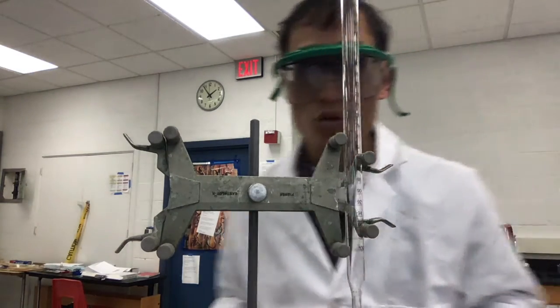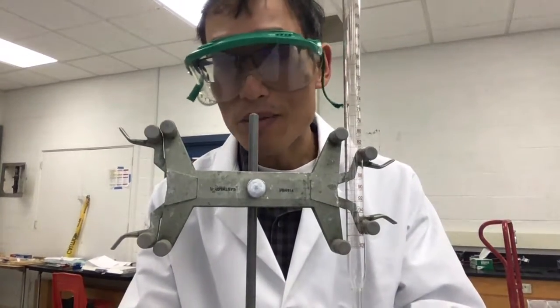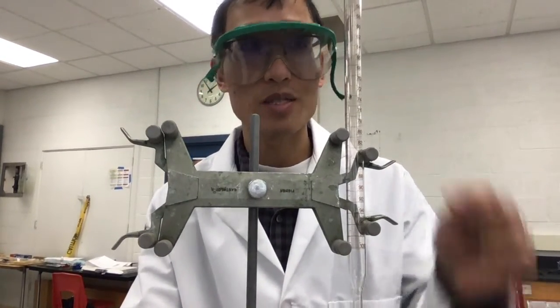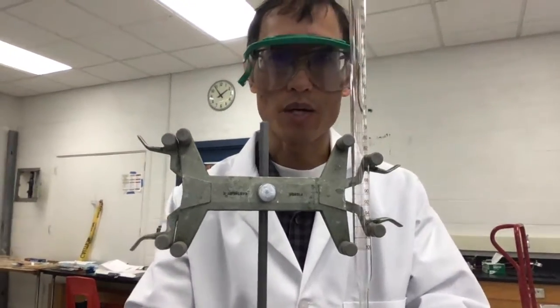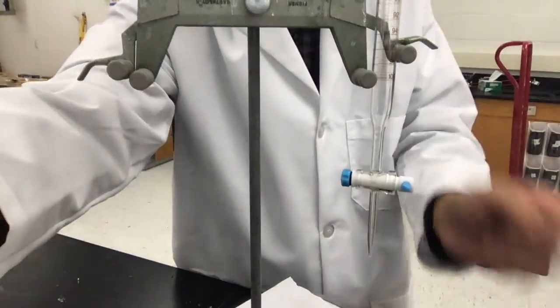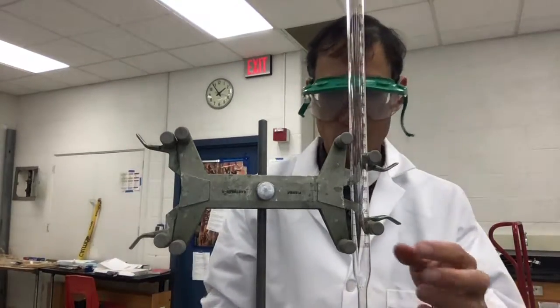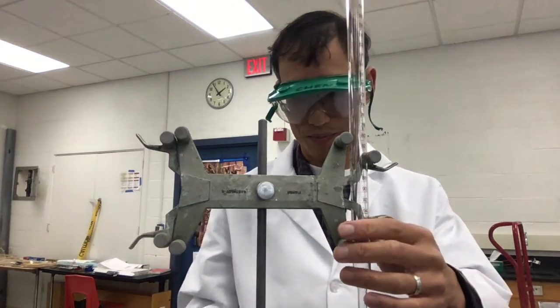And the tricky thing about Burets is reading them. We'll work on reading them because they read backwards, and so you have to kind of get used to how they read. Whenever we use a Buret, we have this thing down here. It's like the valve, called a stopcock, and we're going to rinse it out with water once.